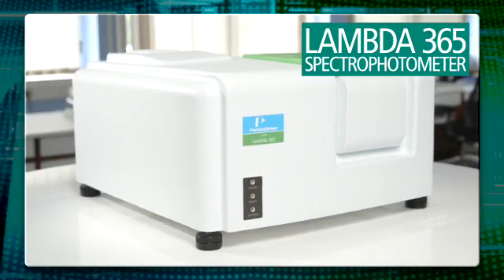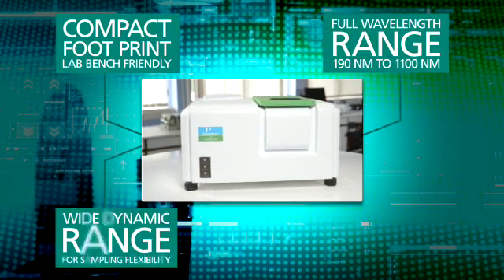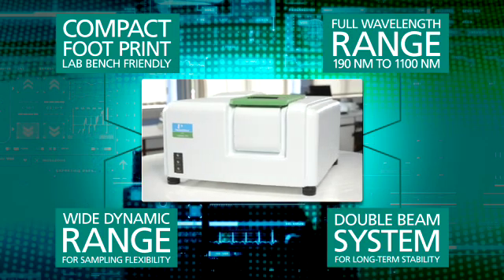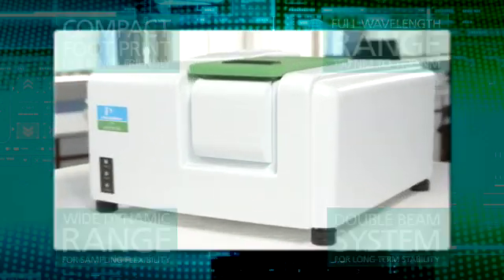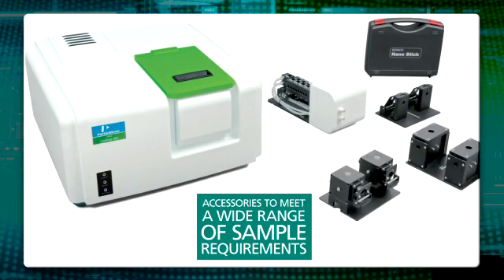The Lambda 365 is a compact, versatile, high-performance double beam spectrophotometer. Easy-to-use software and sample compartment flexibility support a broad range of applications. Easy-to-install accessories minimize setup time and effort, and automated accessory alignment optimizes your productivity.